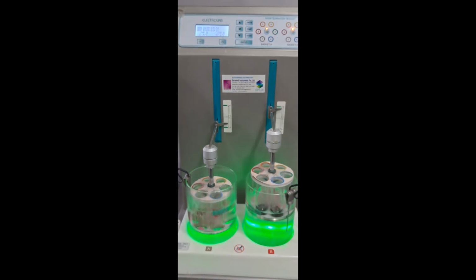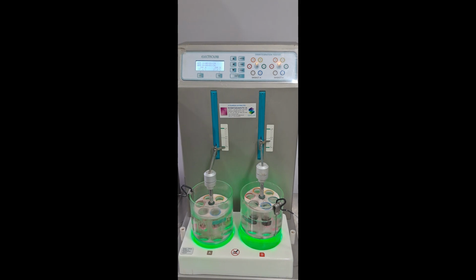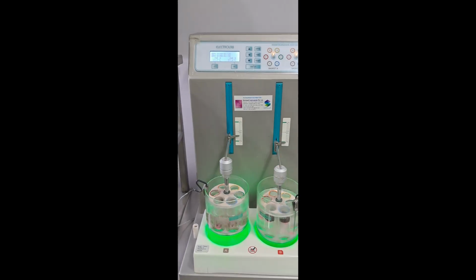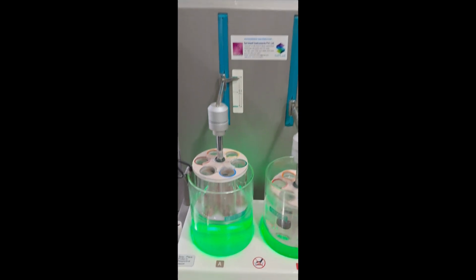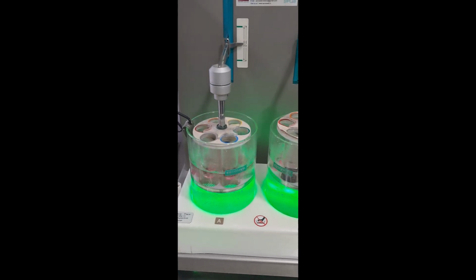It is a crucial quality control test for solid oral dosage forms like tablets, capsules, granules, and pills. The test helps ensure that the drug is released from the dosage form and becomes available for absorption in the body within a specific time frame.